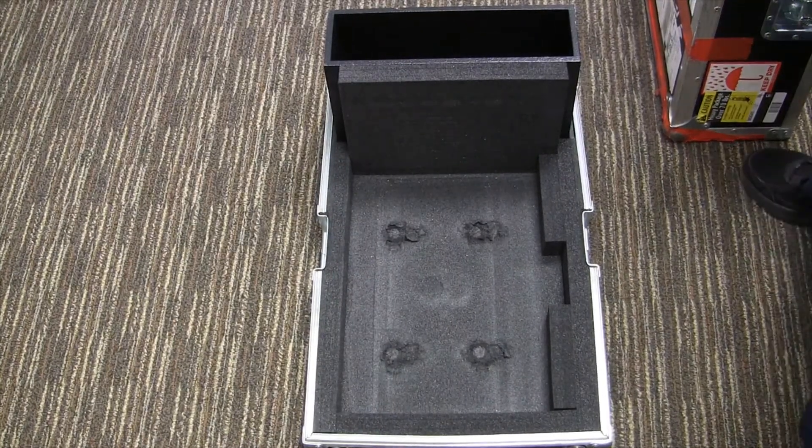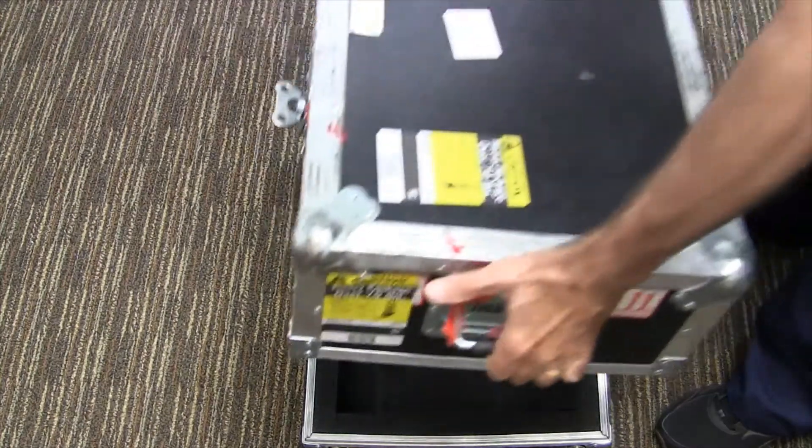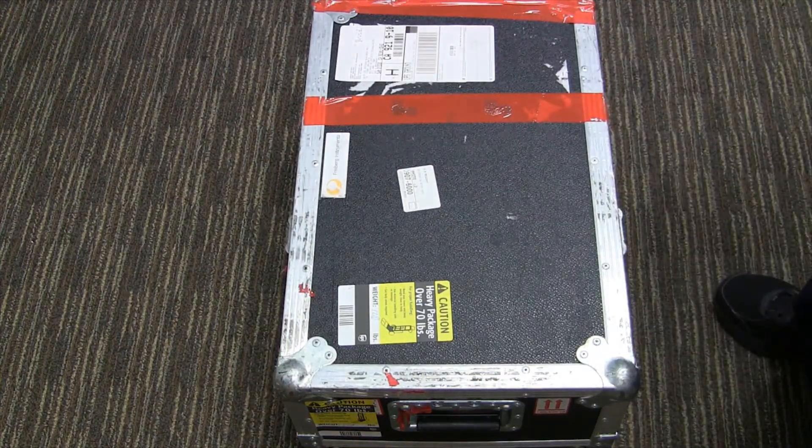Once you've removed the MS-5000 from the shipping container, you can replace the lid, secure the latches, and save the box for future use. This is important in case you need to return the unit for repair or any other sort of maintenance.